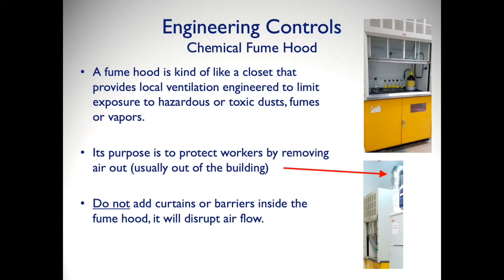Its purpose is to protect workers by removing air out, usually outside of the building. Do not add curtains or barriers inside the fume hood. It will disrupt airflow.